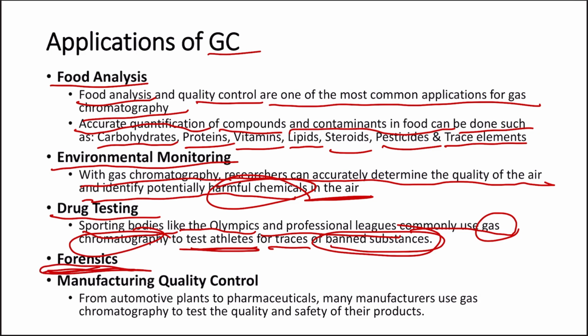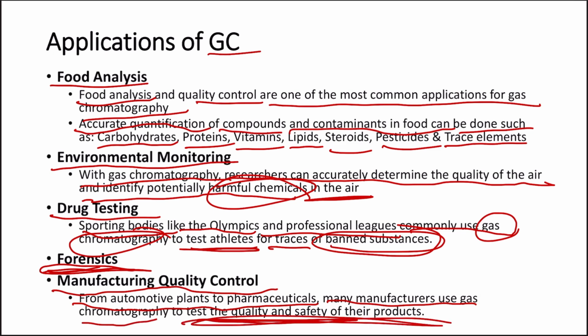Then it is also used in manufacturing quality control measures, that is, from automotive plants to pharmaceuticals. Many manufacturers use gas chromatography to test the quality and safety of their products. So it is used in the pharmaceutical and automotive industries also.